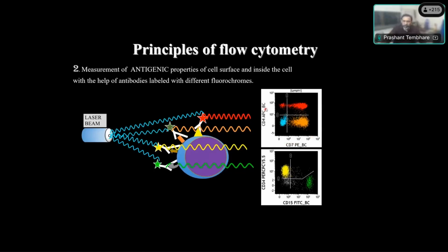We know that CD4 is positive because we have seen the signal from the APC fluorochrome, and we know the APC was attached to the CD4 antibody, which attached to the cell. That means these are CD4 positive cells, like CD4 positive T cells or monocytes. This is how we basically identify cells based on the shape, complexity and size of the cell, and different proteins. Based on the different proteins, we know which type of cell it is.